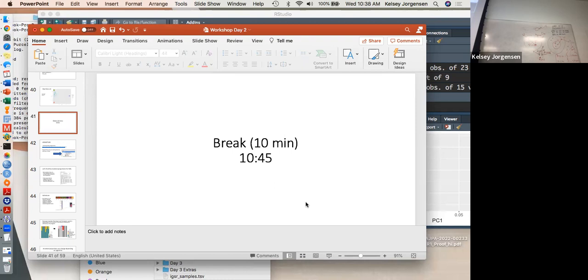And then now you can double click that little dot. And this is the percentage of variance that's explained by each row. So your first PC will explain 33% of your population variance, and your second PC will explain 13.8%. And then after that, we open that in Excel too, and I'll show you on the screen.